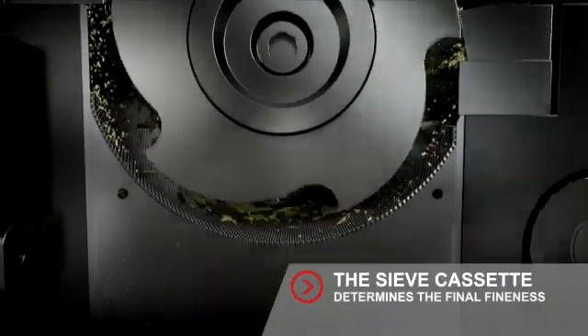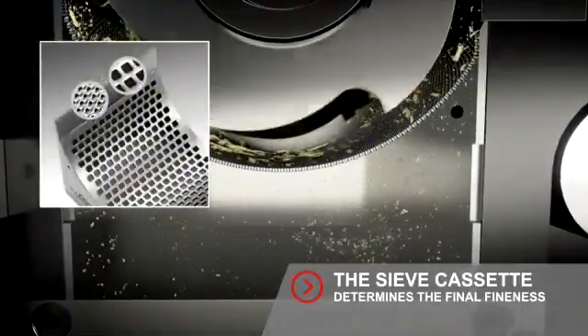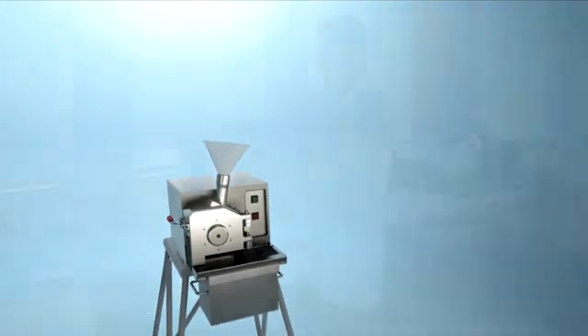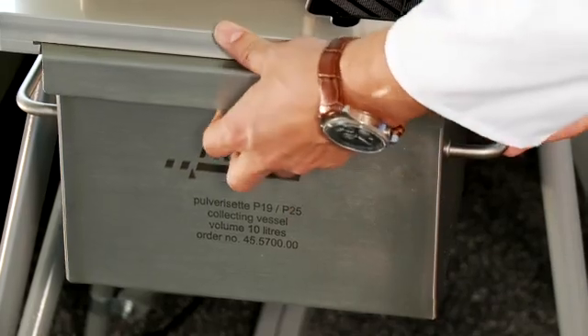The choice of the utilized sieve cassette determines the final fineness of the sample. Fritsch sieve cassettes guarantee the constant distance between rotor and sample material, and always ensure an ideal result.